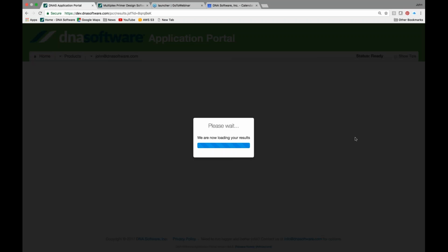All right, this takes about a minute because it has to download the results from the cloud for your primer design sets. So this will just take a little bit of time to populate the page with all of the primer designs. Just give it a moment here.